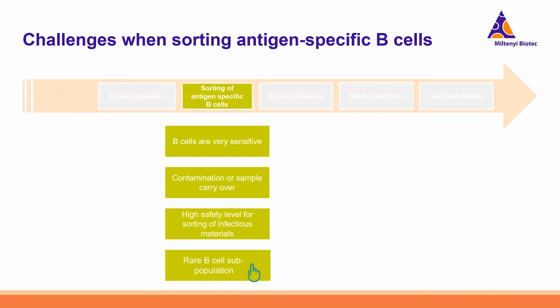And this is really tricky because these cells are really rare. They're very sensitive. We already talked about this. And of course, sample carryover or contamination could be a problem. And of course, when you're working with infectious materials, the high safety level for sorting is sometimes a problem.